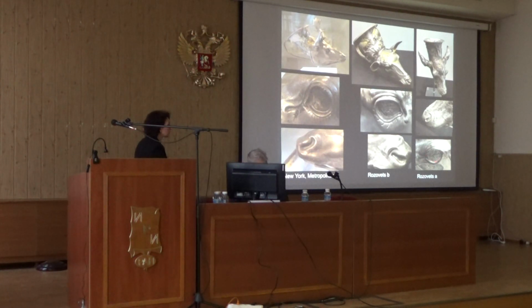I'm sure there was niello here too. And you can see some niello here, I hope. Can you see it? Yes, okay. And you can see how it is worked here. There was some niello inside here in these grooves and on the lashes, just like on the Trieste example.